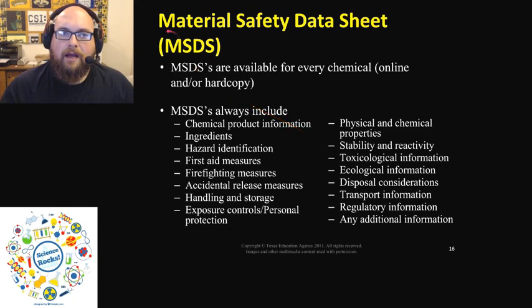Okay, and I will have what is called the Material Safety Data Sheet, or the MSDS. This provides me with information that will, if there is any kind of accident or anything, then we can look at exactly how to treat and take care of, whether it be a chemical touching the skin, or what other kind of first aid measures we must take.